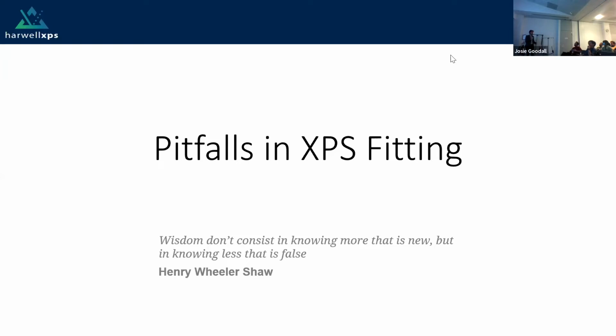We've had some really great examples of XPS usage today. I'm sure many of you who maybe haven't used XPS, or haven't used it for a while, will definitely be running out to collect data. And when you do that, you're going to be faced with a bit of a challenge. A big part of getting the most out of XPS is not only designing a great experiment to collect data, but also doing some meaningful analysis of the data to make sure you understand what it means, try to answer your research question, and try to avoid falling into any of the pitfalls.